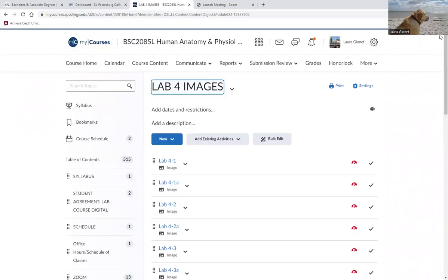I don't think I ask questions about it per se, but you should know the parts of that microscope because you need to be able to use the microscopes eventually in microbiology class. If I can find an extra picture to load up there, which I think would be consistent with what's in the lab book, I will do so.